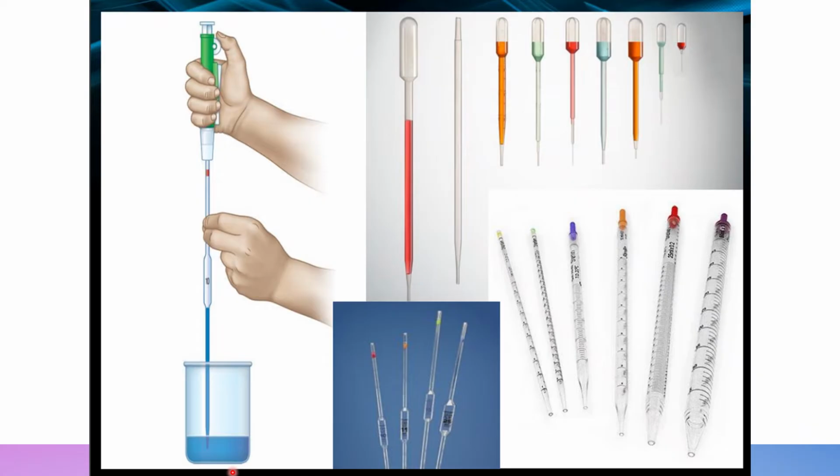The pipette is held upright. So it must be straightened upright, not at an angle, slightly on this angle or any angle. Just hold it upright, okay?